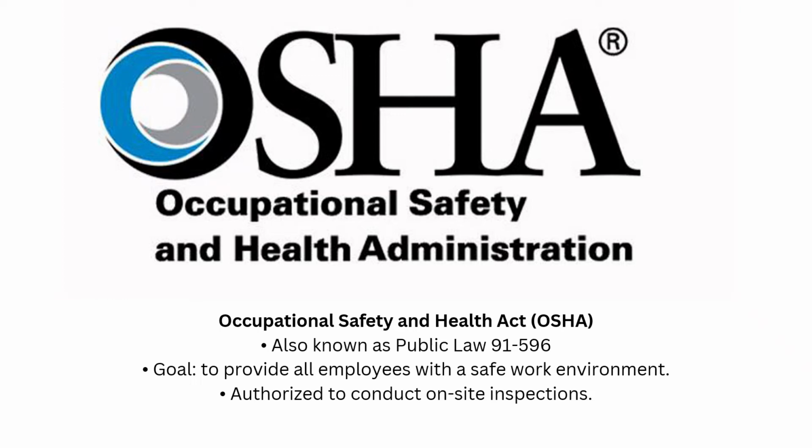Under this legislation, the Occupational Safety and Health Administration, also known as OSHA, is authorized to conduct on-site inspections to determine whether an employer is complying with the mandatory standards. Remember, class, safety is no longer only a moral obligation but also a federal law.